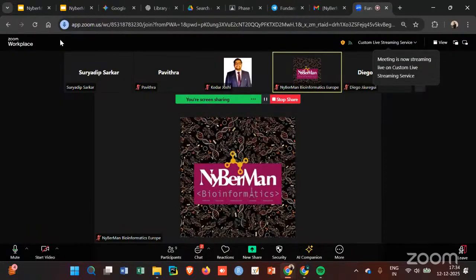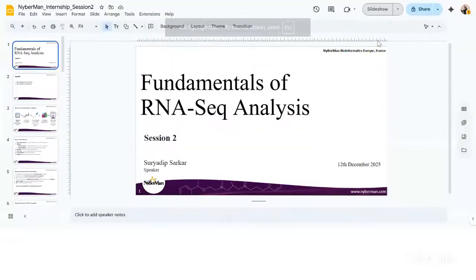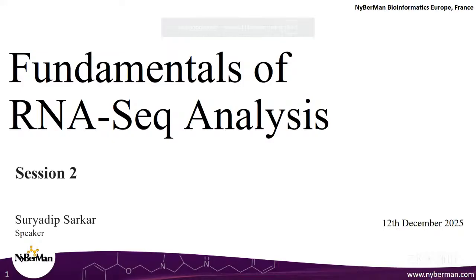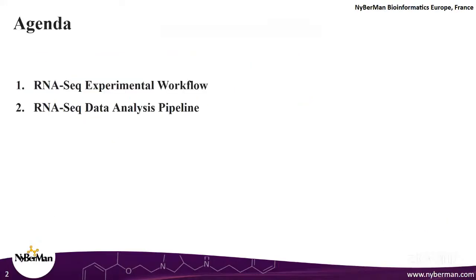Okay, so today is session 2 on our series on the fundamentals of RNA-seq analysis. And our agenda for the session, as I mentioned, is the RNA-seq experimental workflow and the RNA-seq data analysis pipeline. Now, this will be the highlight of our internship. The experimental workflow, as I said, is simply to give you the basics of the know-how of what goes on in the sequencing labs.